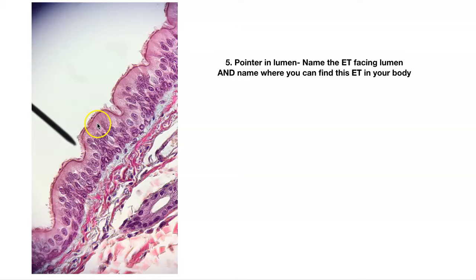Number five. Name this epithelium. We have cilia, elongated nuclei. It looks stratified, but we know it's not — the basement membrane is down here. This is pseudostratified ciliated columnar epithelium. Where can you find this? You find it in your large airways carrying air into your lungs. Most of these slides are taken from your trachea.